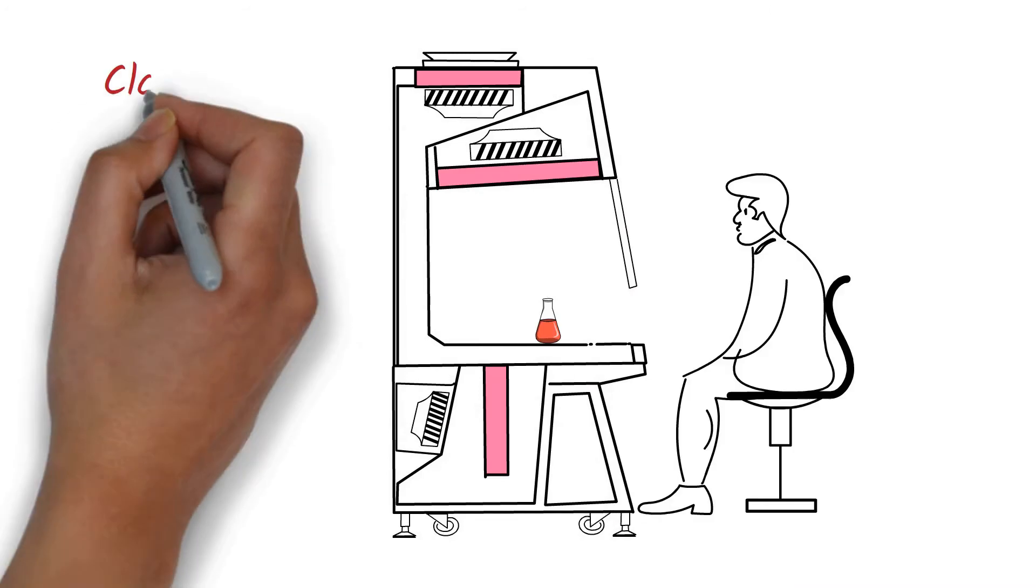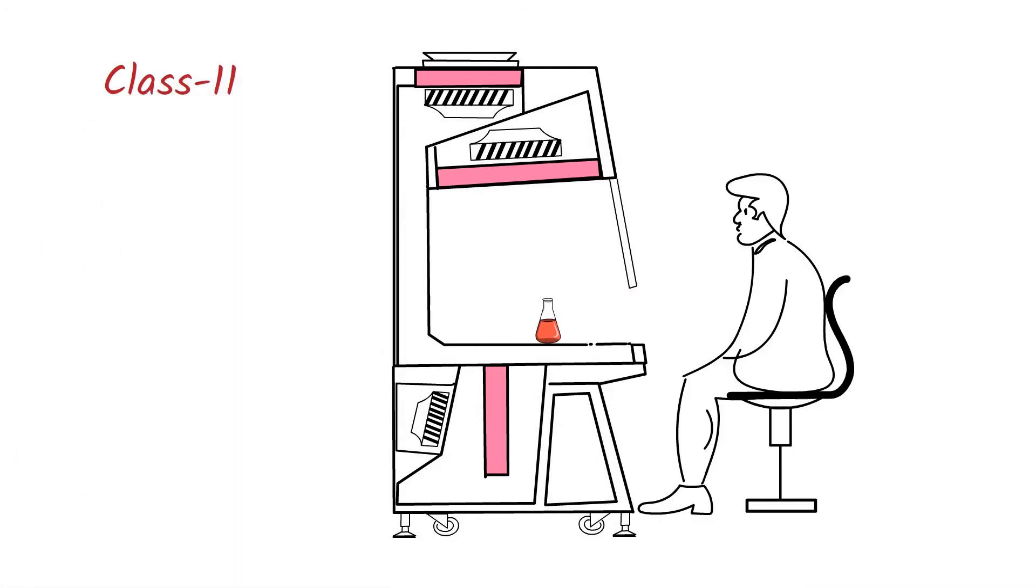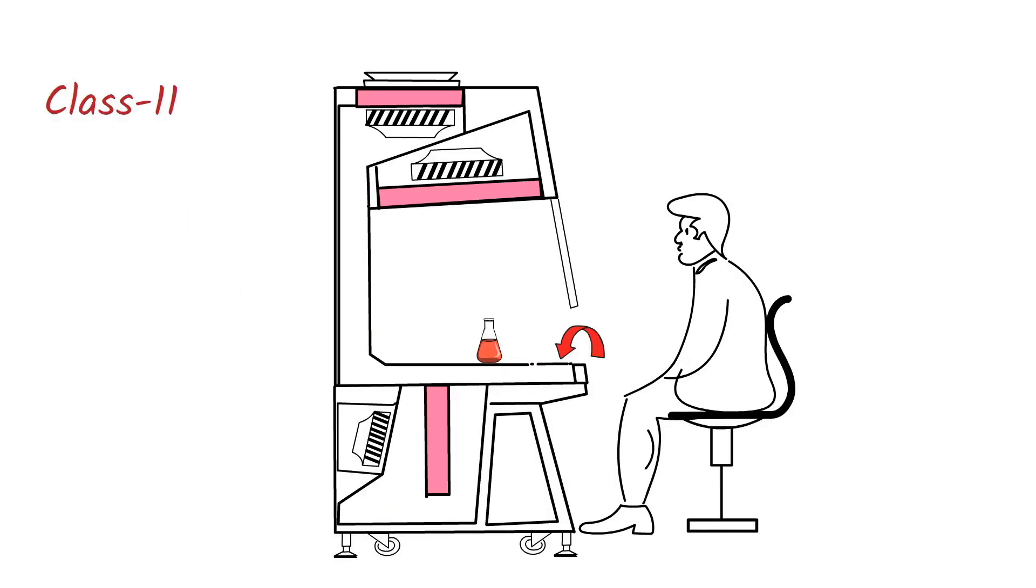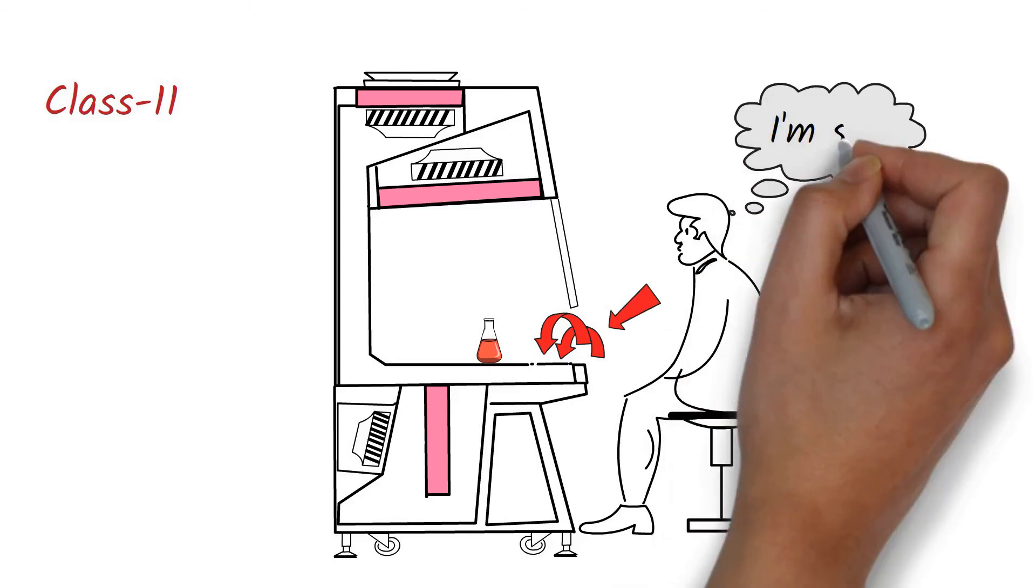On the other hand, in the Class 2 biosafety cabinets, the air enters into the cabinet through the front grill. If you remember, in the laminar airflow, the airflow is towards the operator. Whereas in this case, the air is pulled from the front grill, which means the dirty air is pulled from the operator side and thus providing safety to the operator.